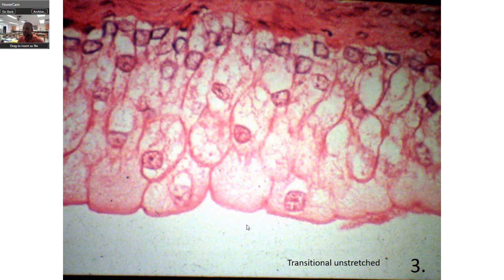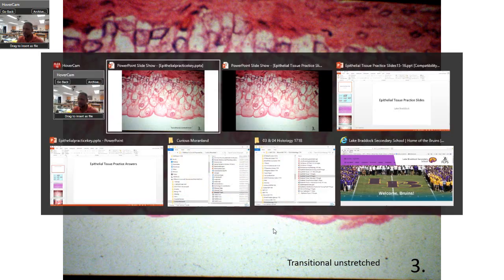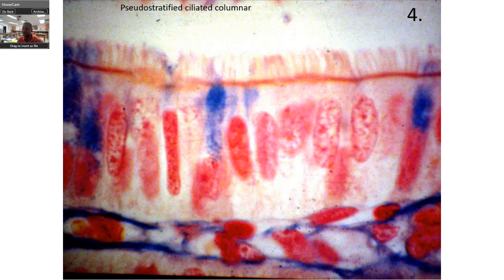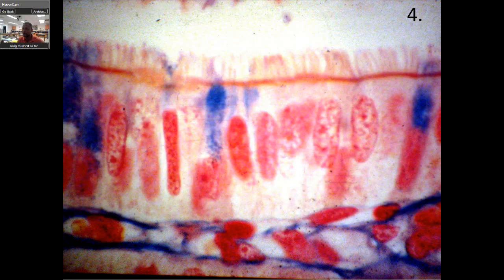Number four — pseudostratified columnar. One of the things you should look for is the cilia. The nuclei are not uniform, as you would see with regular columnar.